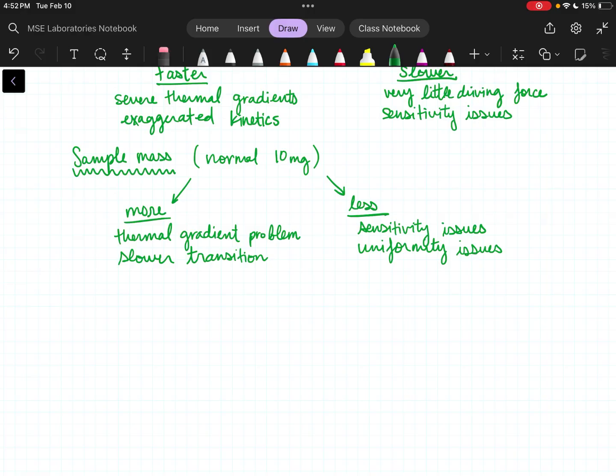Okay, just 2 more little things to talk about when we're prepping our sample. The gas in the atmosphere. There isn't a regular choice with a pros and cons list with this one. This is more just that we do need to be aware of what the surrounding gas looks like. If I have a material like a metal that's going to oxidize and I run it really hot in air, I'm adding another reaction to my list of things that are going to happen over my temperature range.